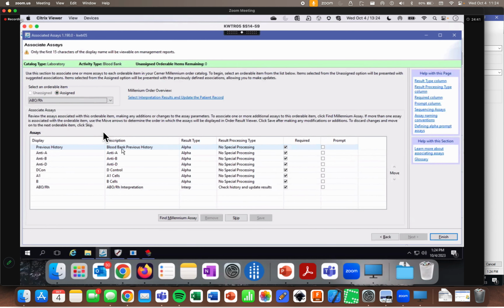Pretty simple, straightforward little alpha response. Its job is just to collect that little data point and then we're done. But whether or not the patient has a previous transfusion history has nothing to do with their actual blood type. If you have a previous transplant history, especially of bone marrow, then there might be something there that we're taking into account, but it's not actually changing my results.